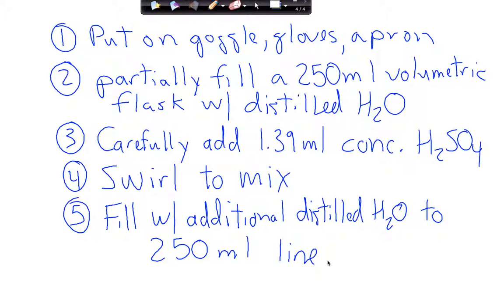They're hydroxide salts of the group 1 and heavy group 2 metals. And so I have all the strong bases in bottles, but they're in pellet form. And so what I have to do to give you the stock solution is actually dissolve an unbelievable amount of pellets in an unbelievably small amount of water. And so it takes a couple days to make. So I make about 250 milliliters of it, and you have to put it on a stirring plate, so it's always stirring, that also has a heater under it that warms it up, and you add it like 10 grams at a time over the course of a couple days. It's horrible. So yeah, you will do that one.